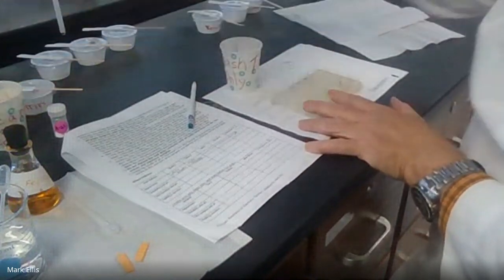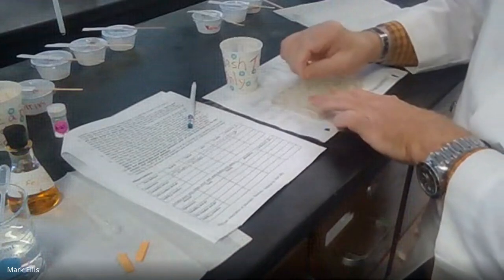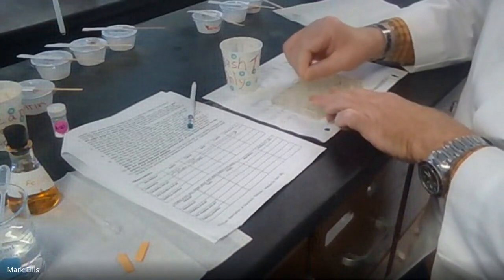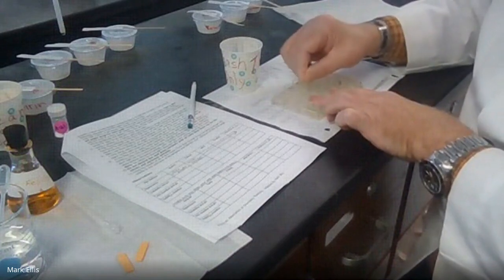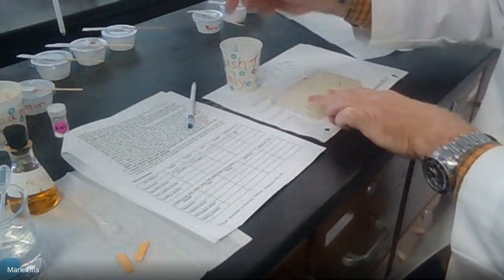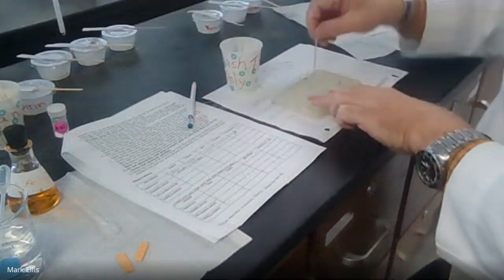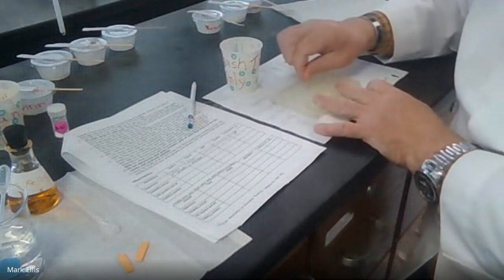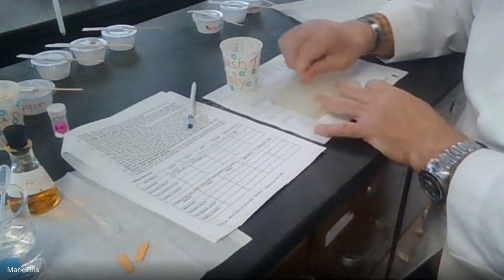Get a clean Q-tip or toothpick and stir the second one, second column. And these are the pointy Q-tips. Sometimes it's easier to break off a flat piece or break off the sharp tip so you get kind of a flatter piece to stir. Stir, stir, stir. Done. Put it in the trash. Third one. Let's go ahead and break this one. Get a little better. Stir, stir, stir.